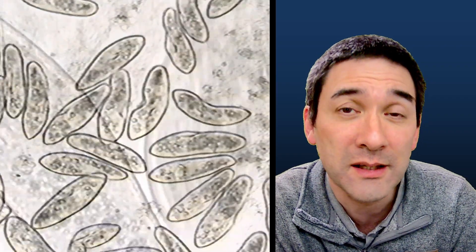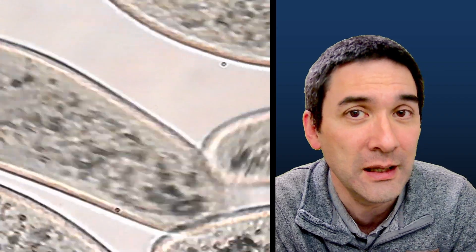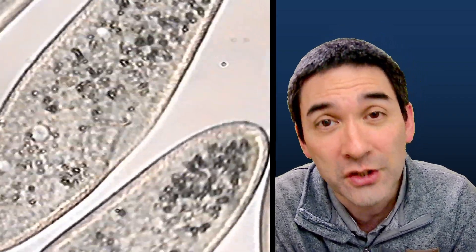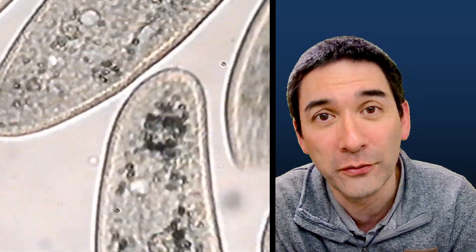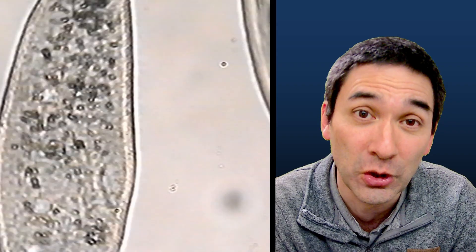But in this case today I actually discovered a video clip where I added some salt water to those paramecia here and then I was able to observe osmosis, which is the diffusion of water.